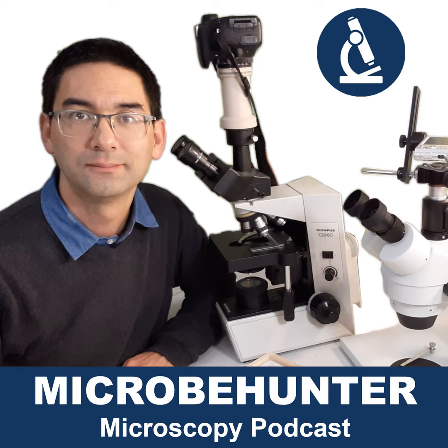Why this is, I guess it's some kind of a strategy, some kind of a management decision. But what I would like to say is that it's not necessarily that the infinity optics automatically give you a better image quality. Having said that, what I heard is that they indeed do have a very good image quality, but this is not necessarily due to the fact that they are infinity optics, but rather because they're using very modern manufacturing techniques and very modern glass chemistry. They're now computer calculated and so on, which was not always done in the past, and this is the reason why some of these objectives have a very high quality. But this is not an inherent issue concerning infinity optics.